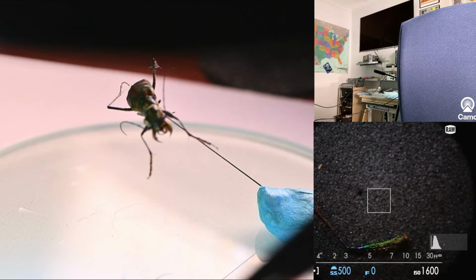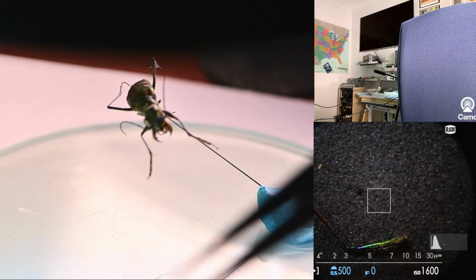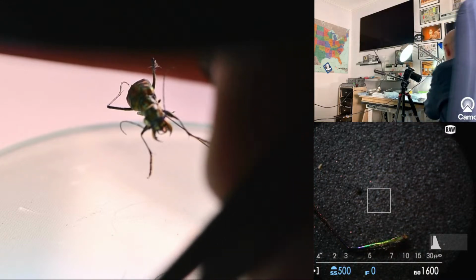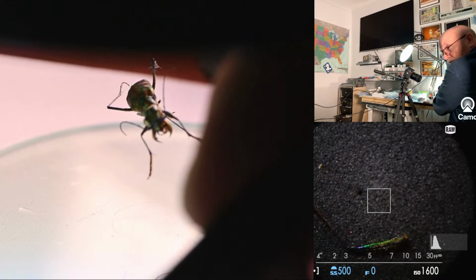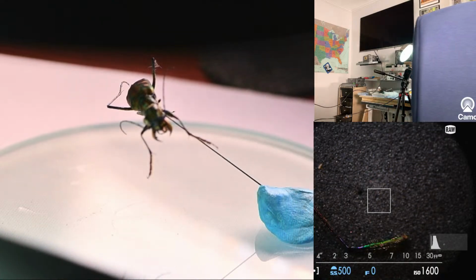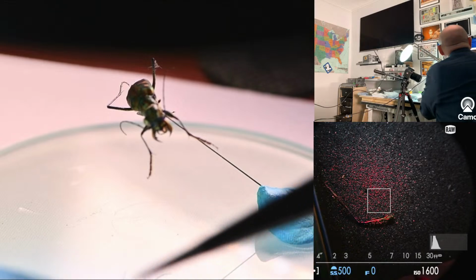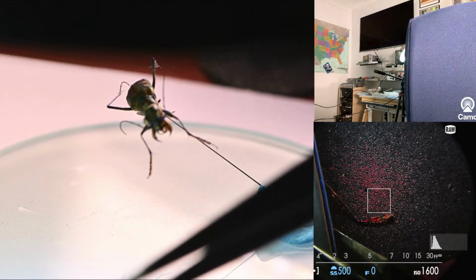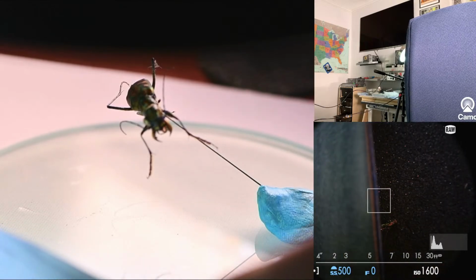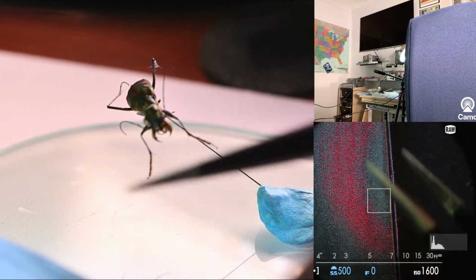The hardest part is now sharpening the inside of the tweezers so that there is a shelf behind the tip. The way you do that, let me make sure that you can see that. It's a little hard for me to see because there's quite a bit of lag. Maybe under the microscope would be easier. Let me try that. Let me see. Bear with me, guys. Yes, you can. Okay, good. Right, so let me focus up just a little. I ought to probably move that bug's leg, but I'm going to leave it like this.